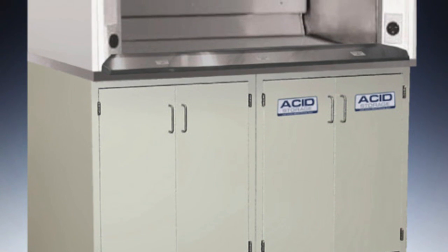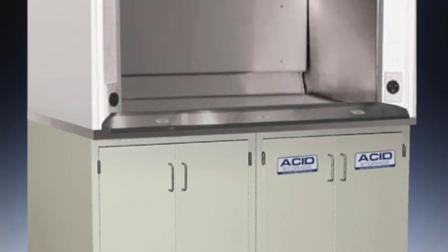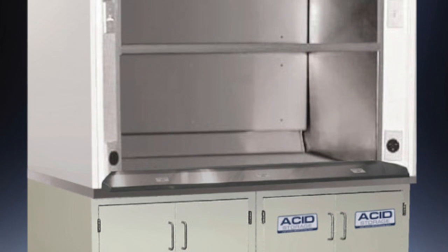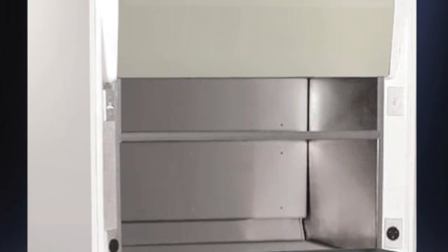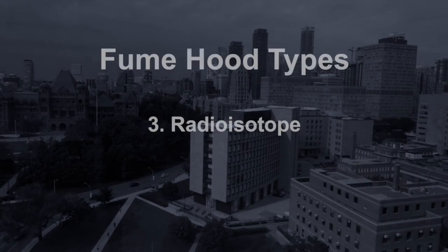Perchloric acid fume hoods are designed specifically for the use of perchloric acid. Interior liners are made of acid-resistant materials. Interior corners are coved to aid in cleaning. Perchloric fume hoods require built-in water washdown systems in order to prevent the buildup of explosive perchlorate salt deposits.